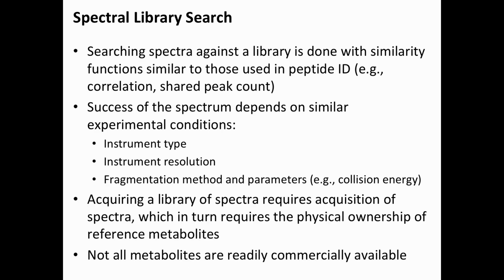So in spectral library search, we are really trying to identify the closest experimental spectrum that's known. You need to have libraries that you can download, or your in-house curated libraries or commercial libraries that you buy. There is a top tool that can do that for you if you like. It depends on the instrument type, on the instrument resolution. All these things need to be carefully controlled.